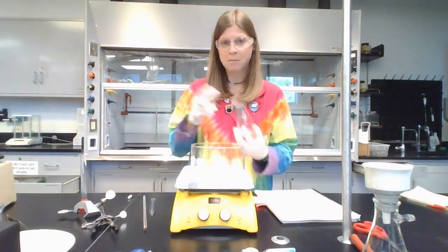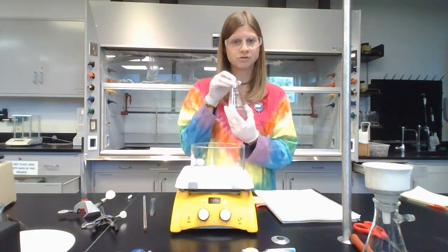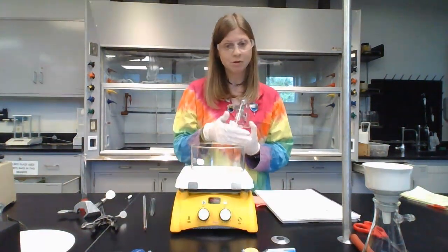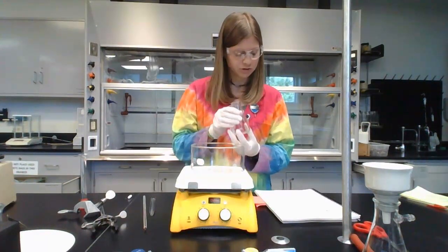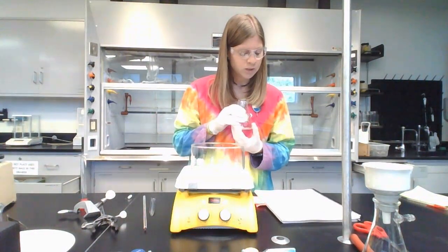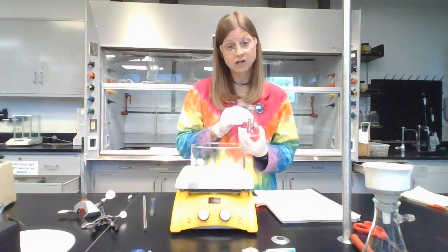And then you'll use your weigh paper to transfer it into your Erlenmeyer flask. Now there's really not a way for you to rinse the weigh paper. We will be adding other chemicals, but very small volumes of those chemicals. So again, salicylic acid, it's a solid, just going to be at the bottom. Next, we need to add acetic anhydride to this.